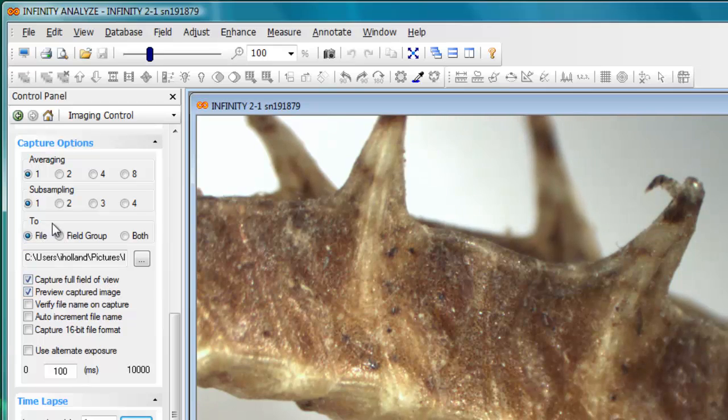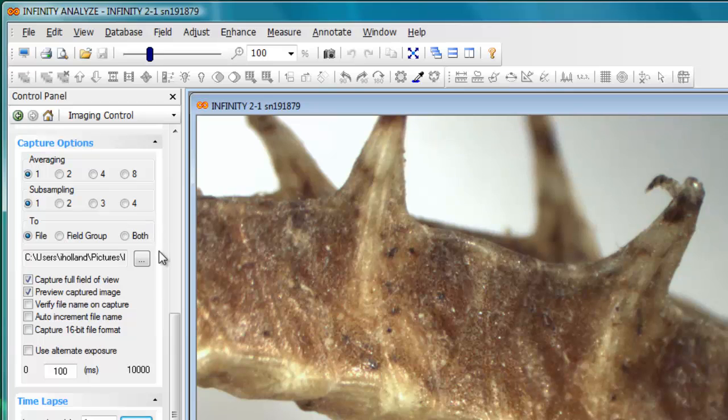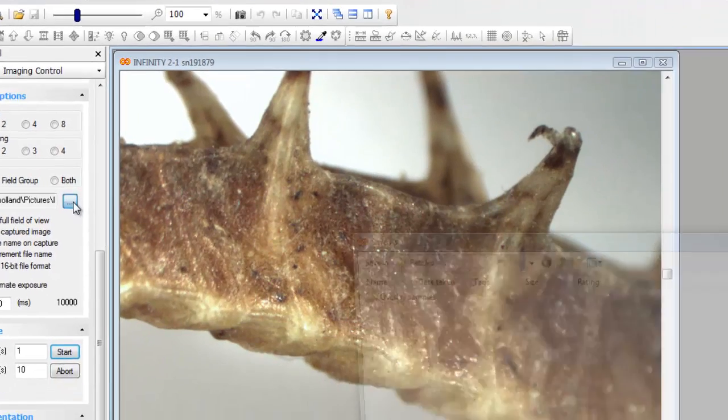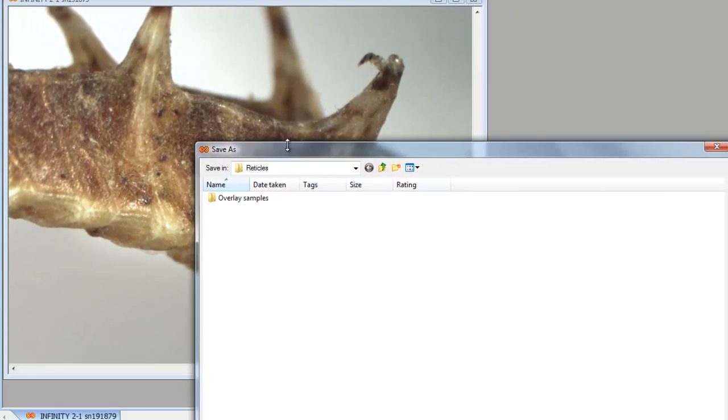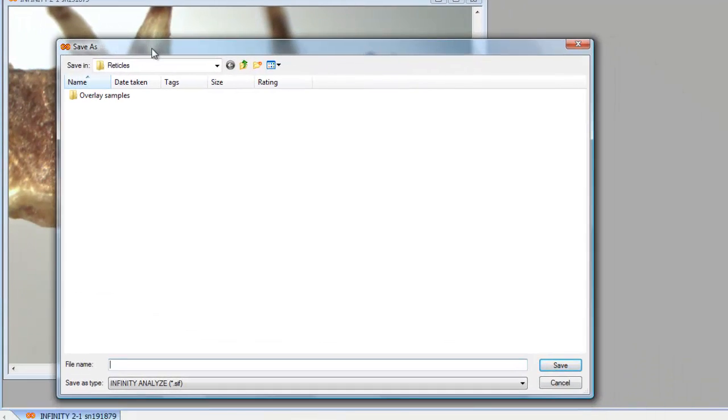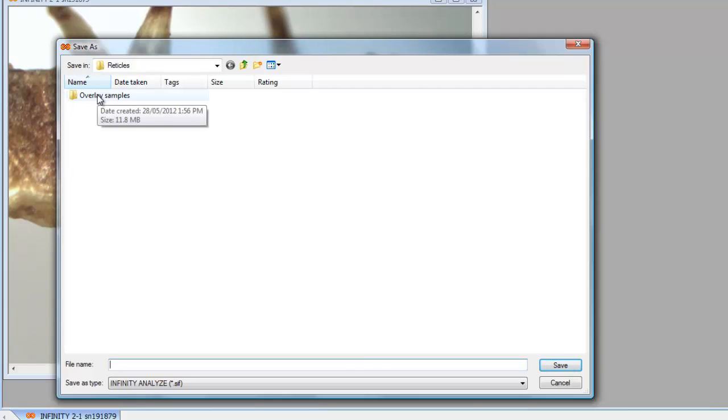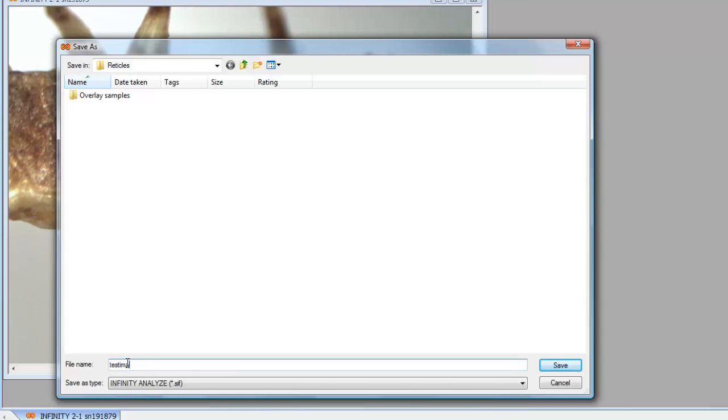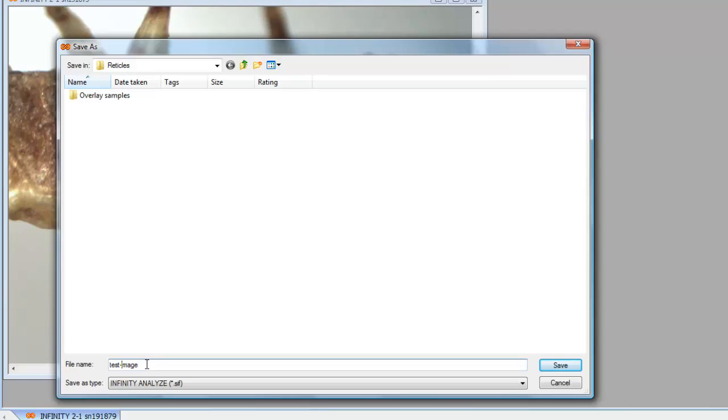An important part of this option for saving files is to click on this button here with the three dots, which opens a standard Windows Save As dialog box. So you can specify a folder name as well as type in a file name, and that file name can be the prefix to which a numerical sequence is added later.